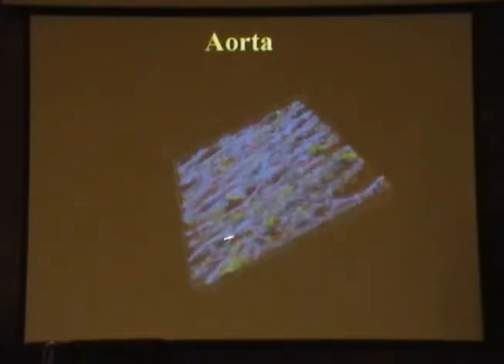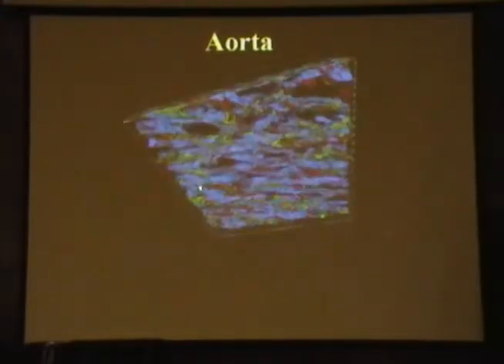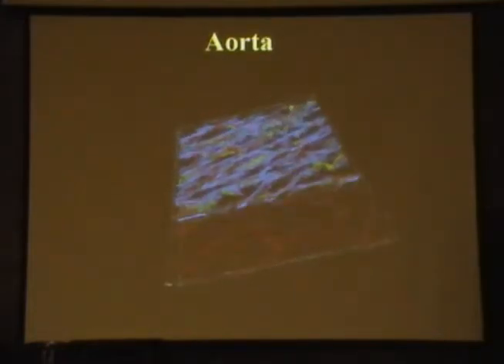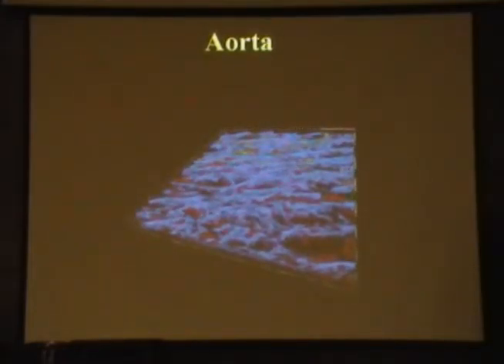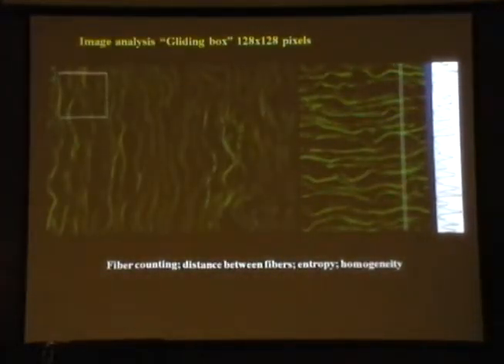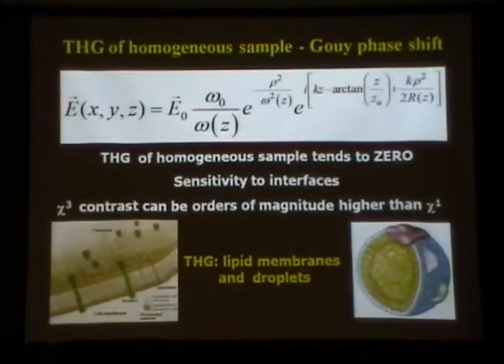With that aorta, we can make movies like this. We are showing here fluorescence, and the forward and the backward second harmonic generation, and then the computer will reconstruct it and play around and make nice animations. And we can take that kind of measurement with this so-called gliding box here, to measure, take the Fourier transform, to take the entropy of this and try to make sense of it with the things that you know.